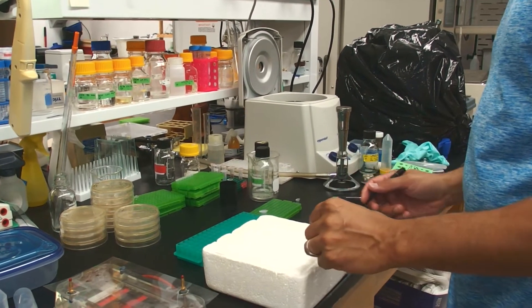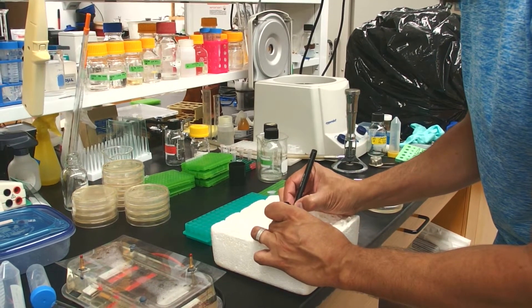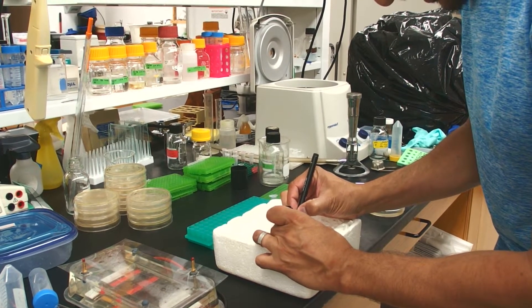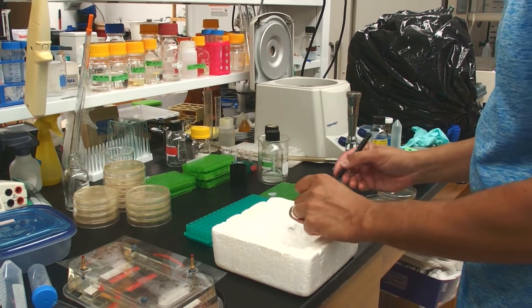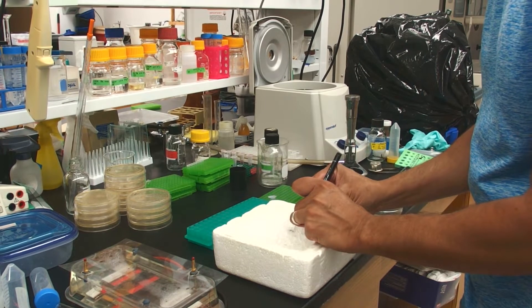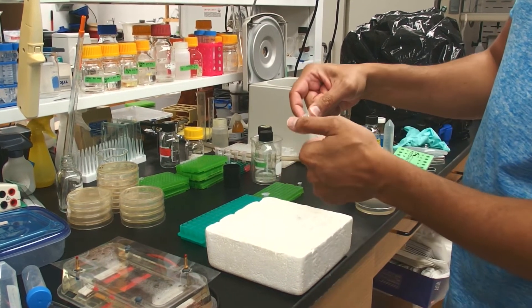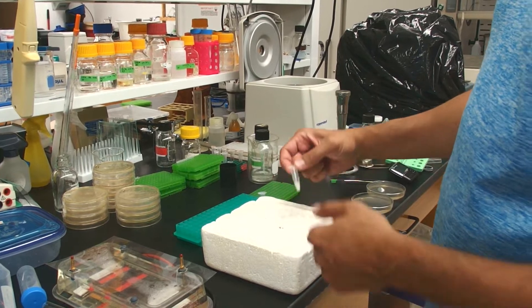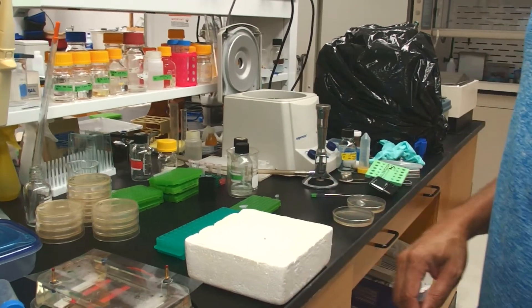We need to label our tubes — it's something that will let you get your right transformation onto the right plate. A lot of protocols are also going to tell you that you should let them sit on ice for a long time. This is also not necessary.